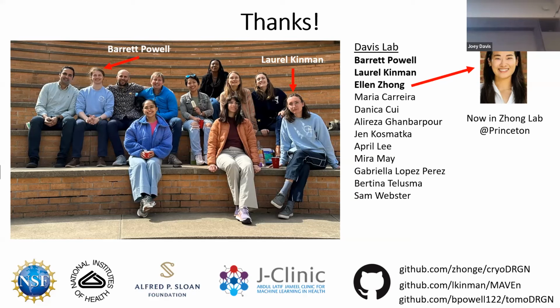So the third approach is something that we've been working on, which is to make biochemically defined ground truth data sets. The way that we've done that is we've taken a dead Cas9, so catalytically inactive Cas9, that gives you the ability to target a DNA of interest, and synthesize that DNA, and then we can make it with various numbers of nucleotide extensions from the Cas9.